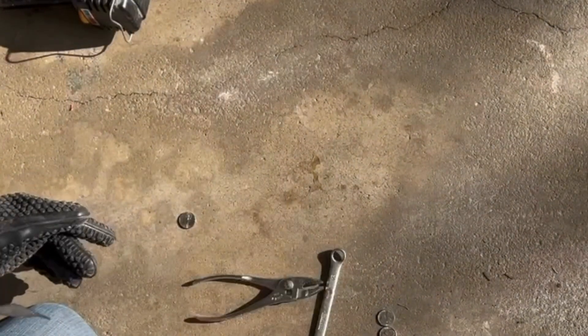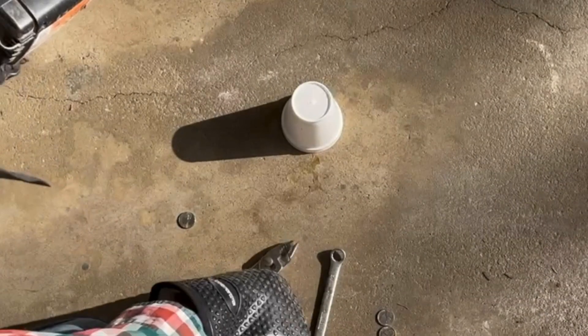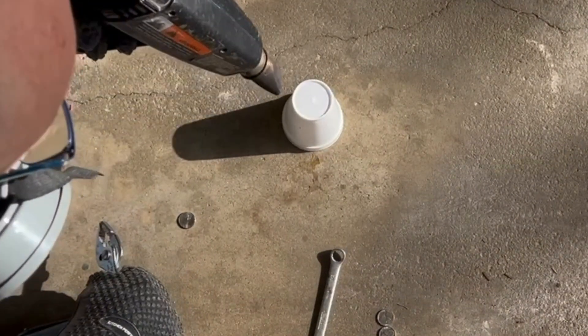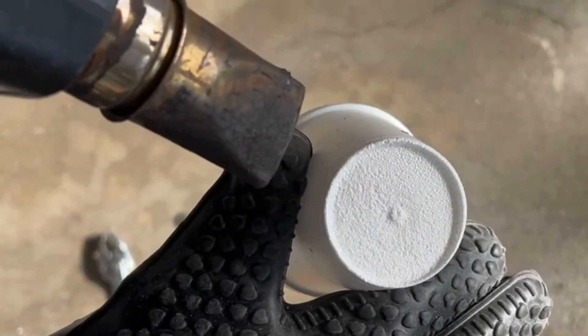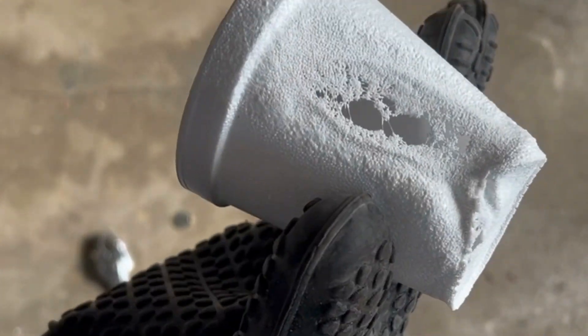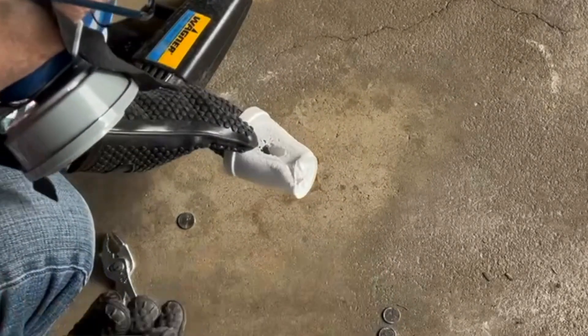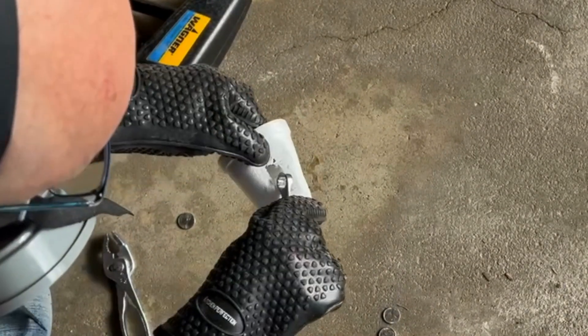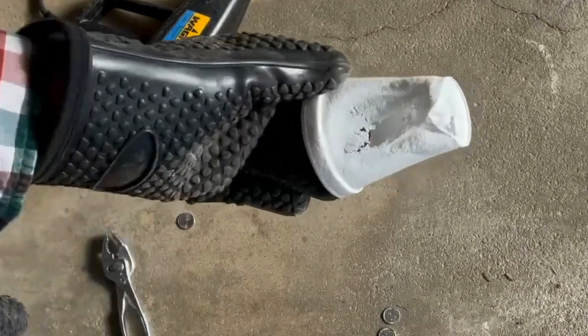Let's try a third object — this styrofoam cup. This is interesting because this one seems to be breaking apart. The little white beads that make it up are separating as I heat it. I can't tell if that's melting or not. I can't reshape it very easily either, which maybe is because it cooled down and is now a solid again. I'm not sure if this is a thermoplastic or not.